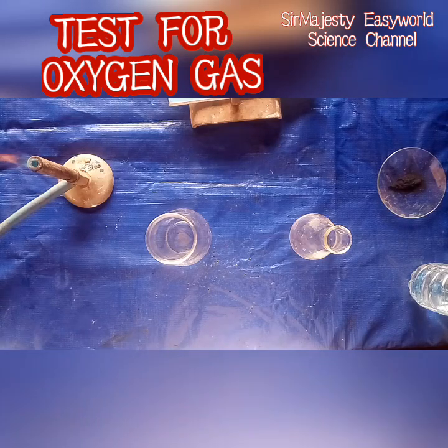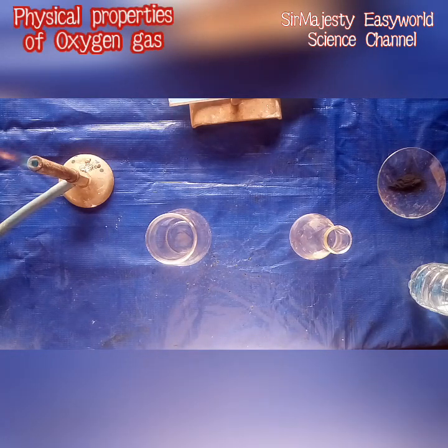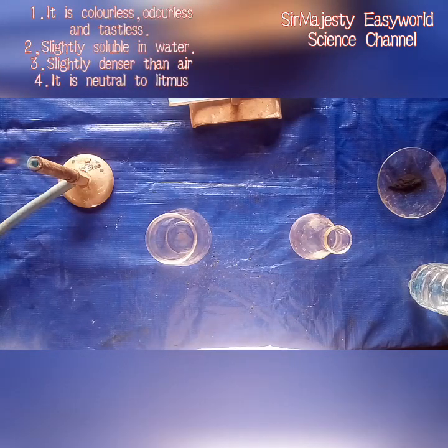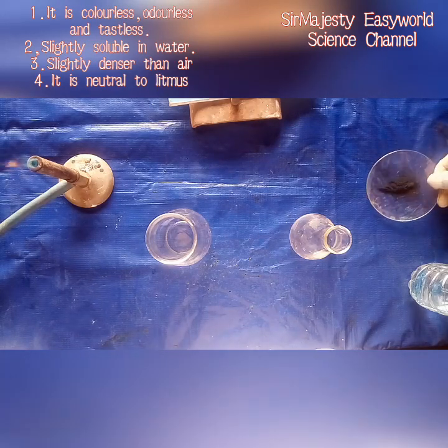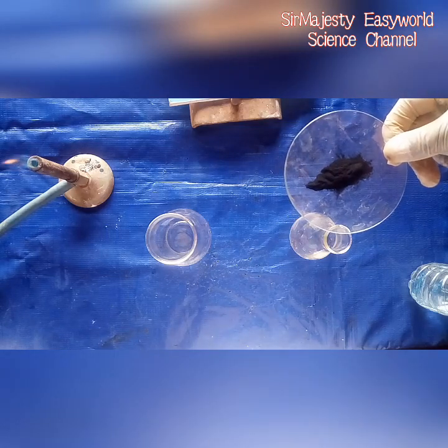Today we will produce oxygen gas and a test that will confirm that the gas is oxygen gas. Remember our past video, how to make a smoke bomb with an ordinary used battery, your Leclanché cell. You can refer to that video — remember we used the black powder in that video and we called it manganese dioxide.